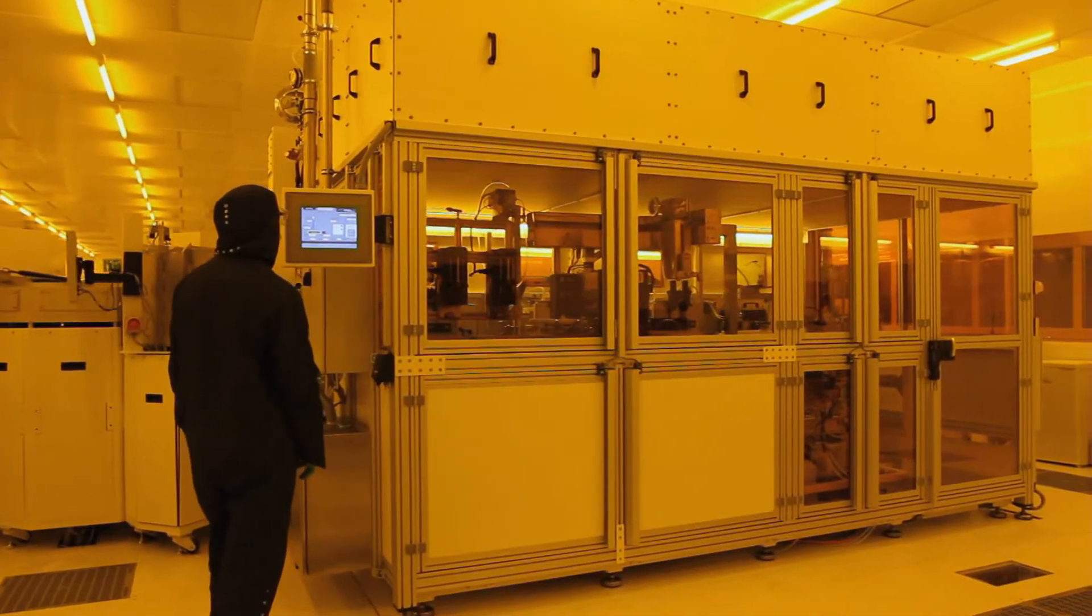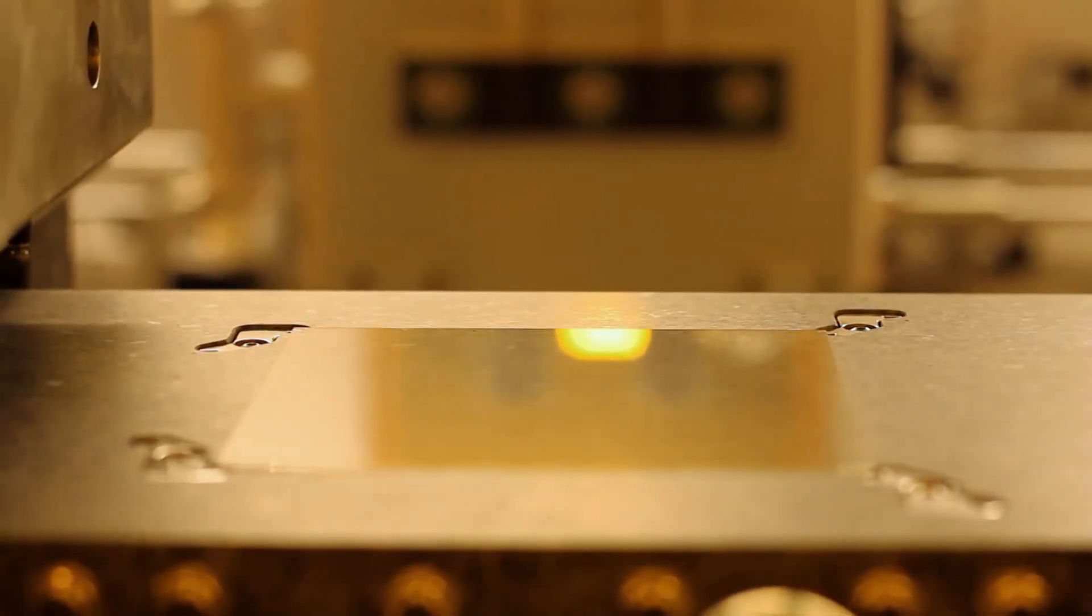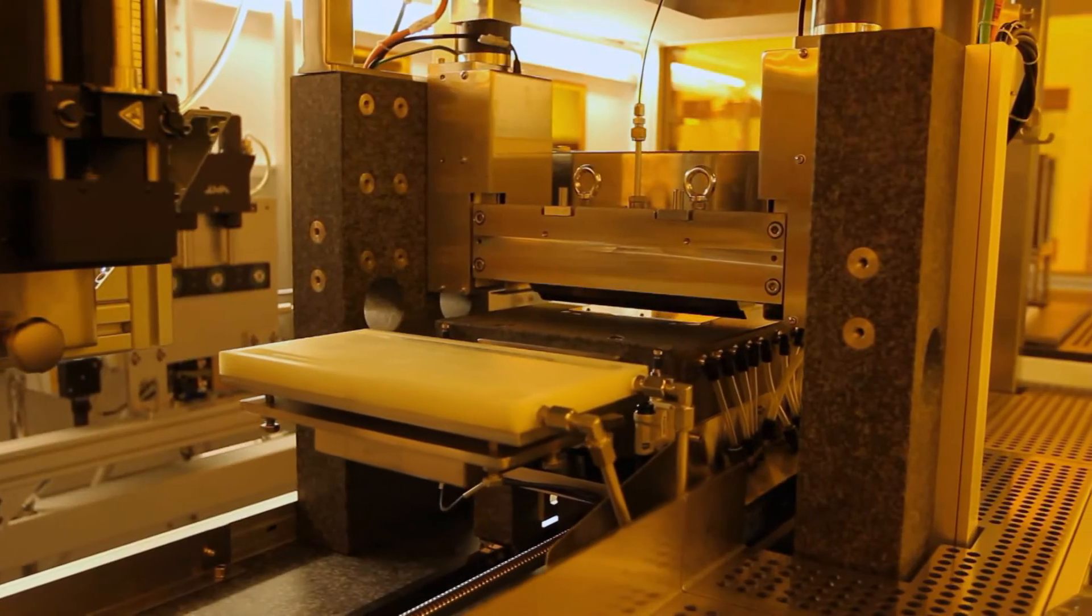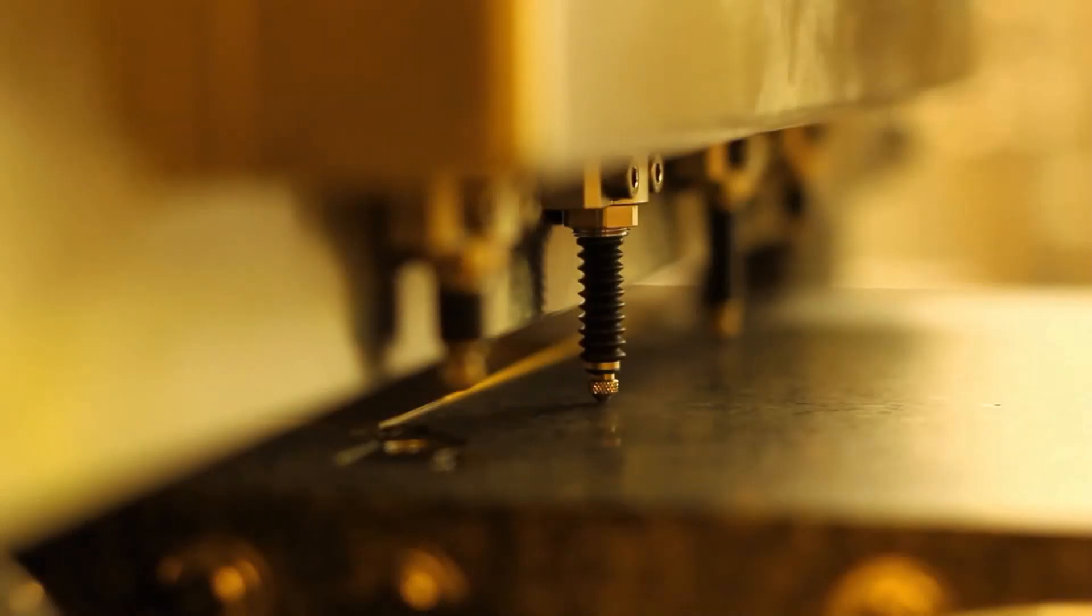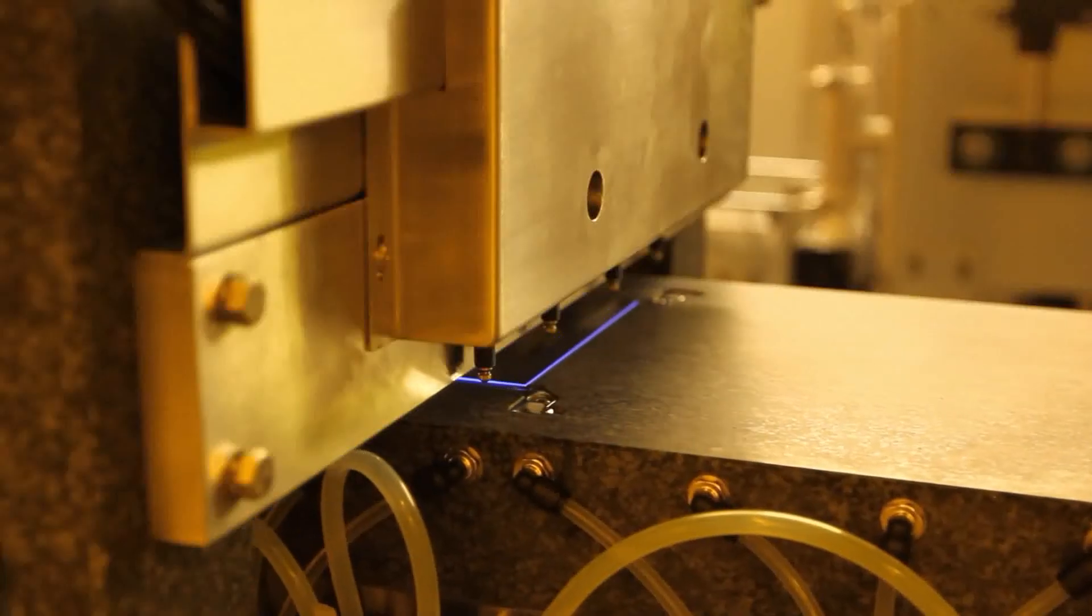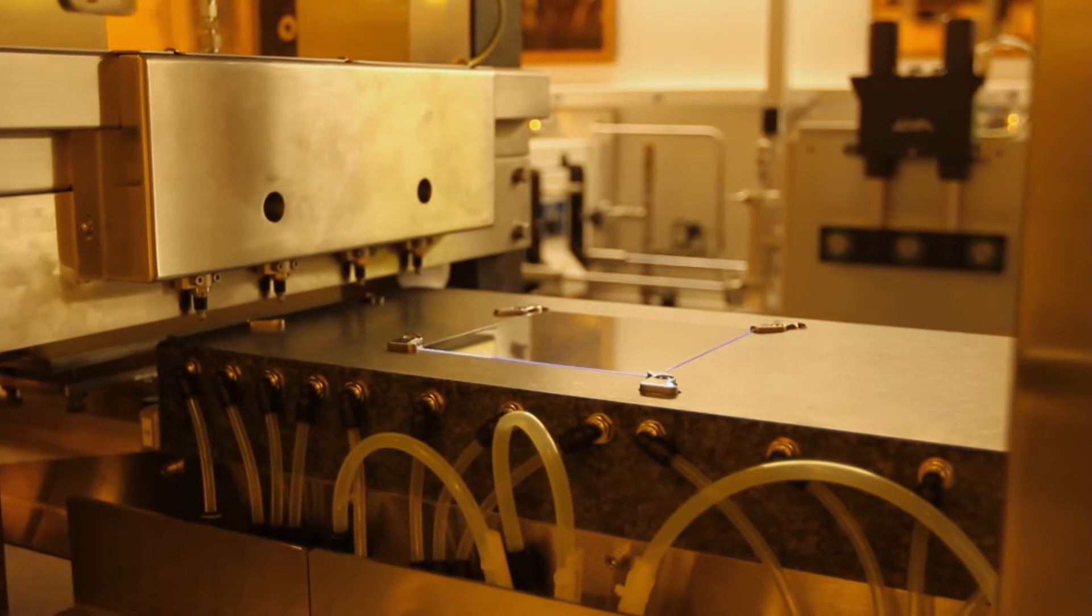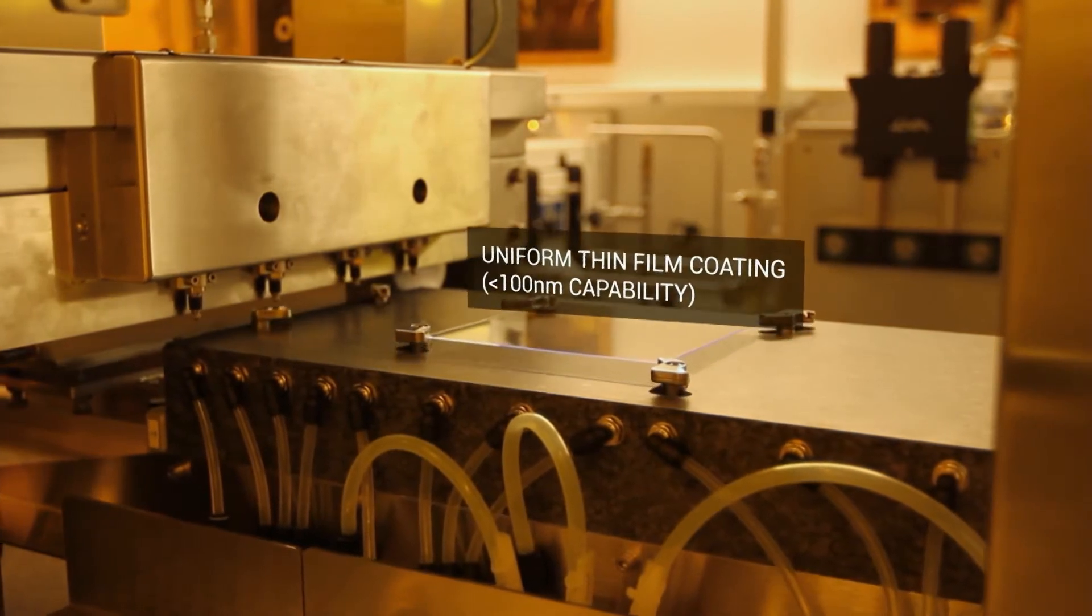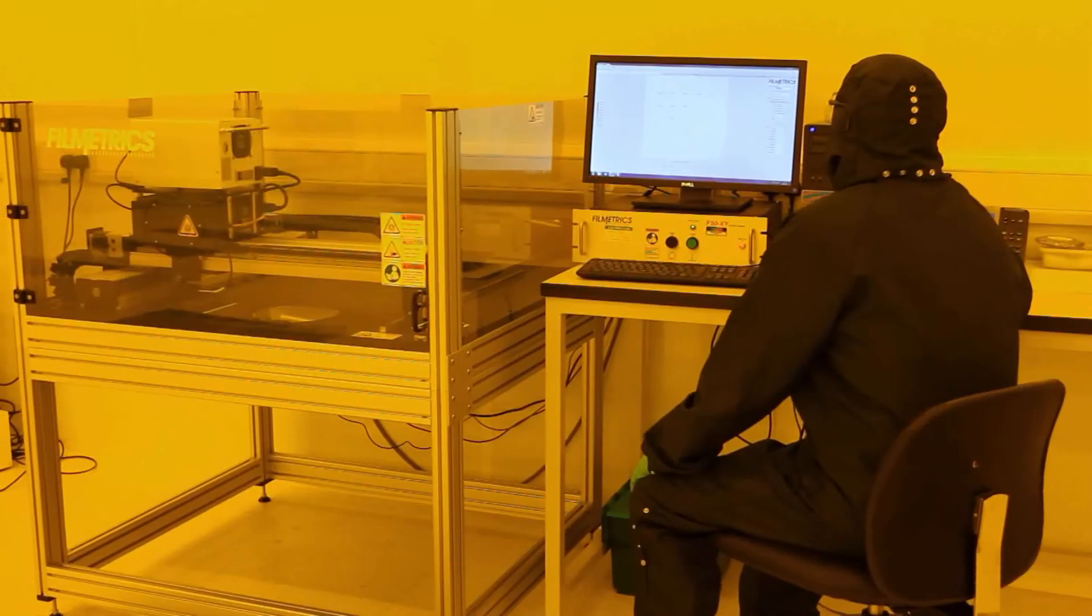The ambient module has been designed to allow the solution coating of non-air sensitive materials utilizing a slot die coating technique. Slot die coating is a scalable thin film coating process which provides an efficient use of materials in comparison to the more conventional spin coating techniques employed for round substrates. Dry film thickness of less than 100 nm can be uniformly coated with this technique.